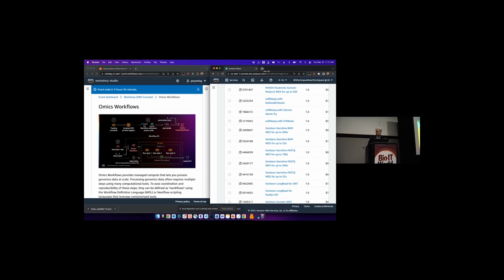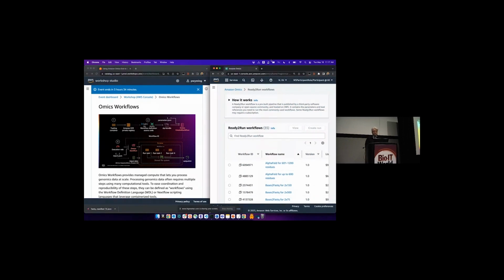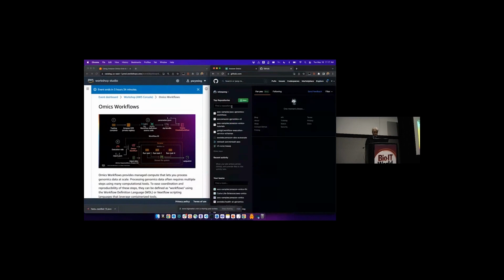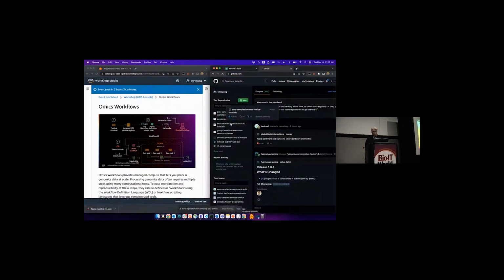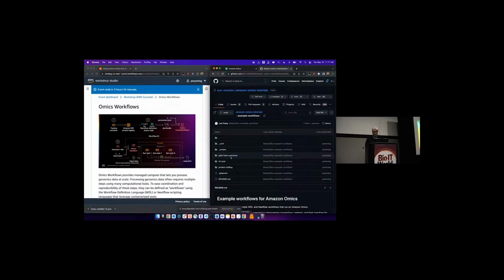Like if I wanted to get in here and see how all these are constructed and how they run, to build my own workflows. There are a couple. I can point you to that right now. It's actually out on GitHub, Omics tutorials. A subset of these are open source: GATK, AlphaFold, OpenFold, and I'm blanking on the last one. Single cell RNA-seq. Thanks, Sissy.